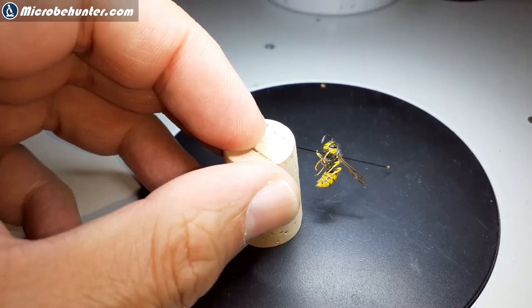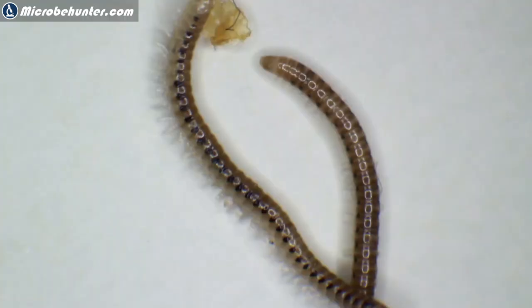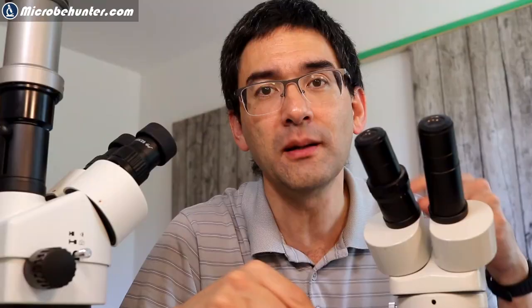There is a fundamental difference between stereo and compound microscopes. If you want to identify spiders, insects, minerals, or invertebrates like worms, these are fairly large organisms. Plant parts, for example, are fairly large and they are opaque — they don't allow light to go through. So you have to use a stereo microscope. You simply take the object as it is, put it under the stereo microscope, and you get a three-dimensional stereoscopic image.